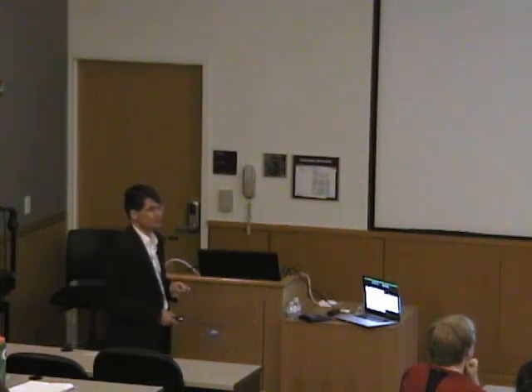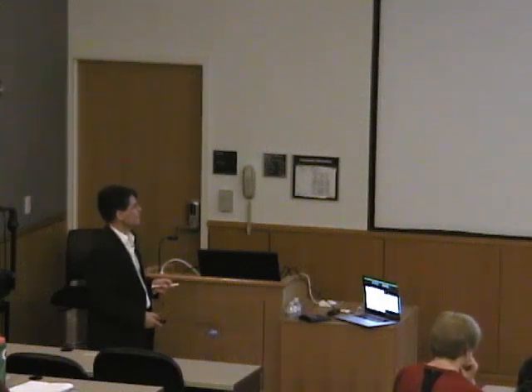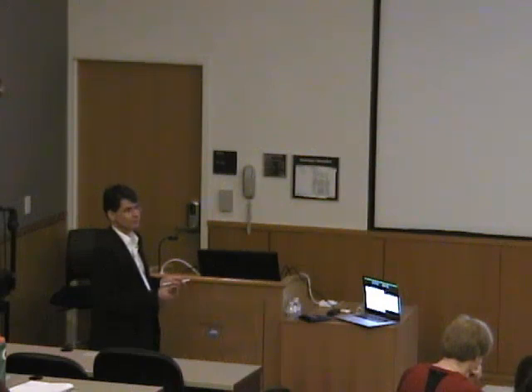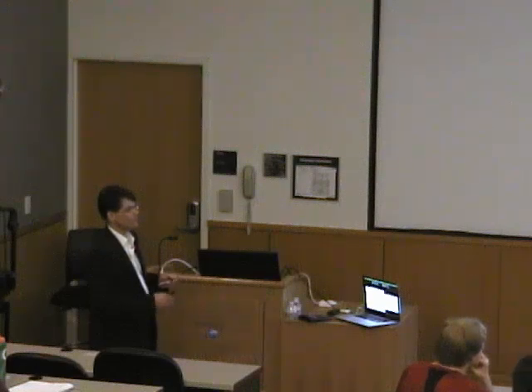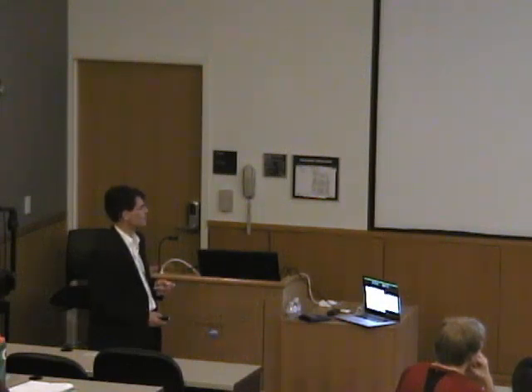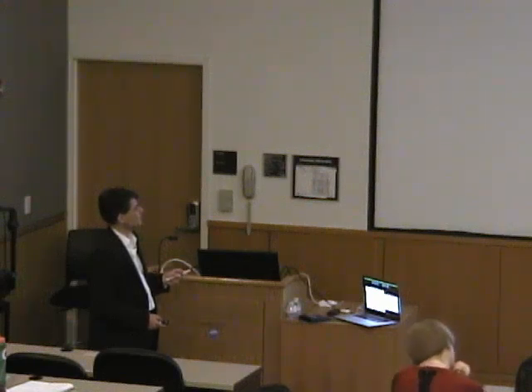Now that will have contributions from both the Rieske center and the active site. So in order to separate them, you need to do a bit of biochemistry, and you can take the non-heme iron center out by treating it with EDTA or cyanide or something, and then do dialysis. And then you only have the MCD spectrum of the Rieske center here, and it looks funny, and it doesn't interest us, right? So that is really not what we are after. We are after the spectrum of the active site iron, and we obtain it by carefully subtracting this spectrum from this spectrum.